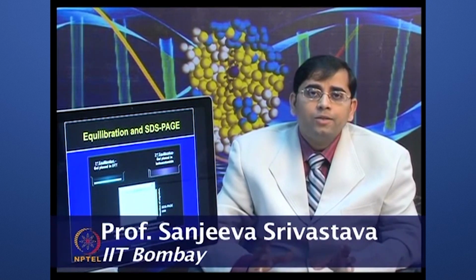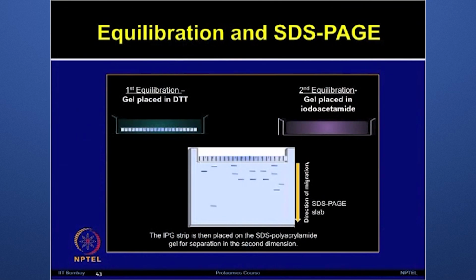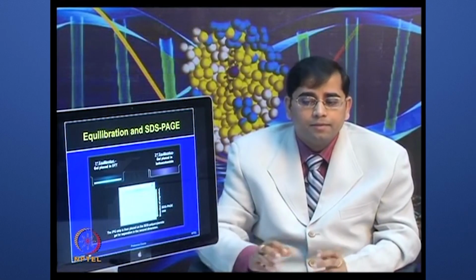So, overall the steps, as you can see, are exactly the same as what one does in 2-dimensional electrophoresis. The only variation here is that all your control and treatment samples have been mixed together and are now separated on one IPG strip. This strip is placed on one SDS PAGE gel and all the proteins will be separated in one gel itself, whether they come from the control or treatments.